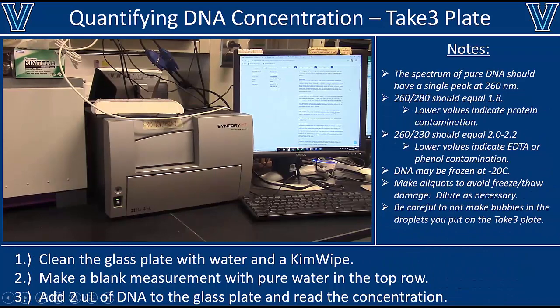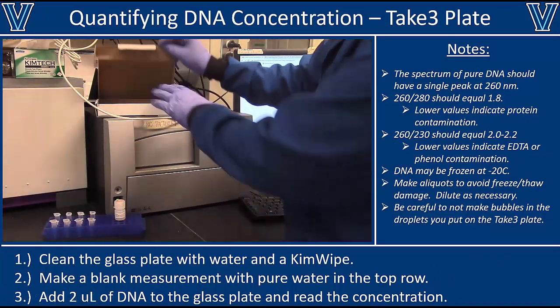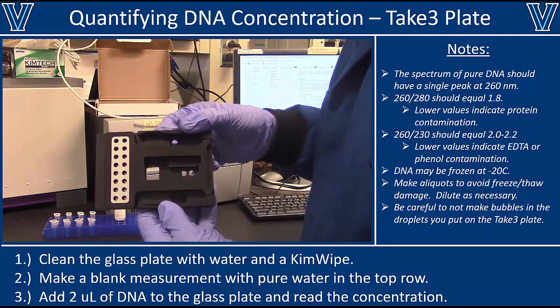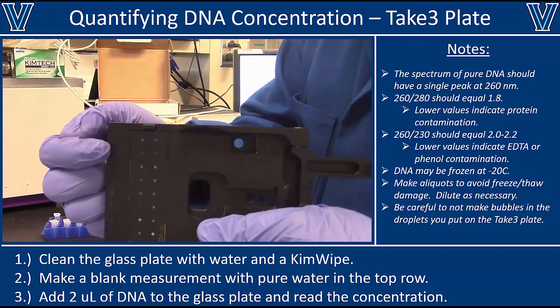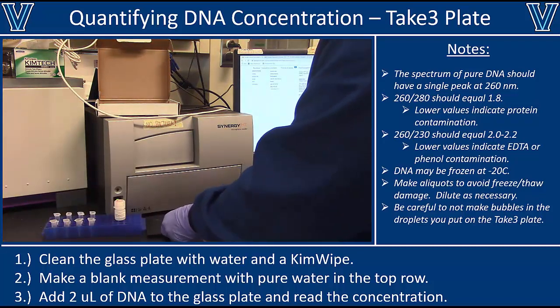So here's how you would use the Take3 plate to quantify the concentration of DNA in your plasmid sample. First of all, you want to take the plate out of its carrying case. It's a very expensive piece of equipment, so please take care of it. But you want to make sure that it is clean. This is where we're going to load the samples here.